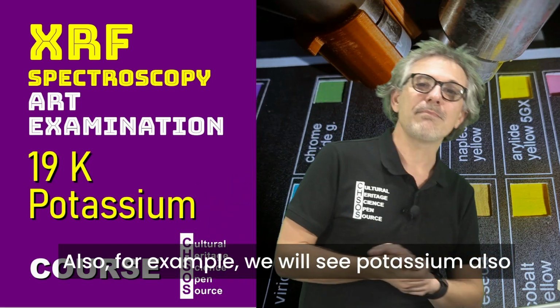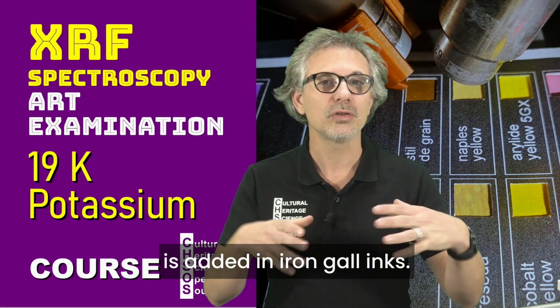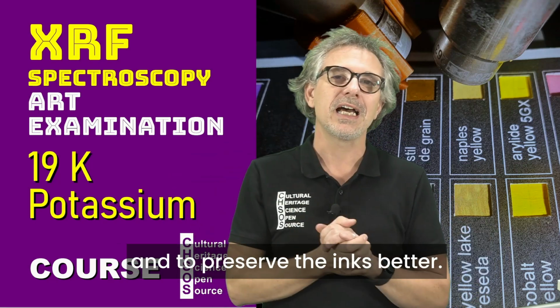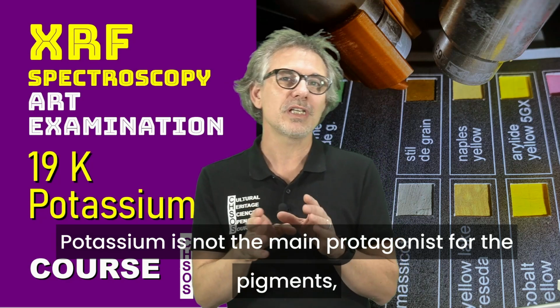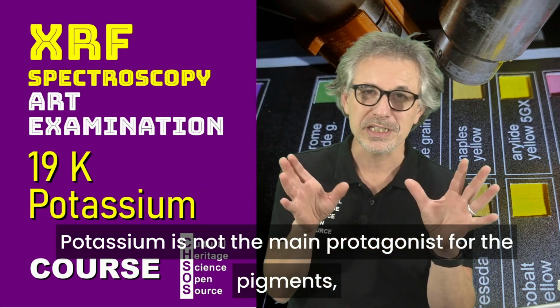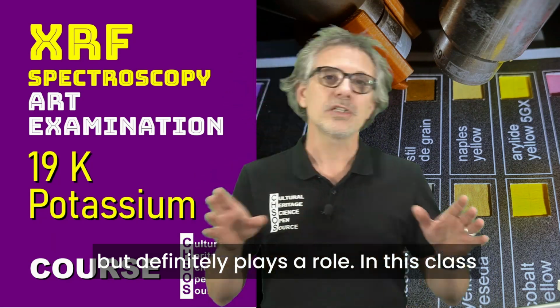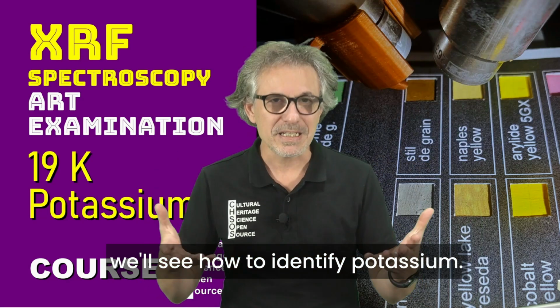Also, for example, we will see potassium added in iron gall inks in order to make them more fluid and to preserve the inks better. Potassium is not the main protagonist for the pigments, but it definitely plays a role. In this class, we'll see how to identify potassium.